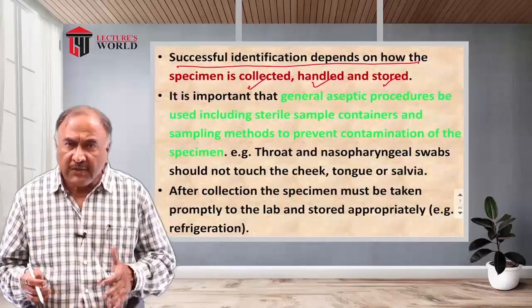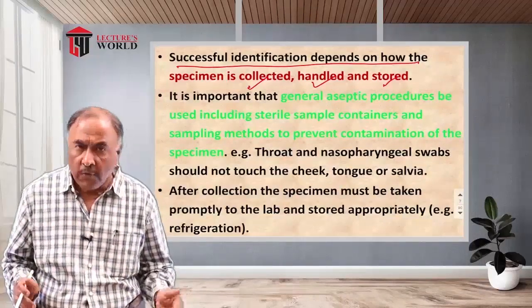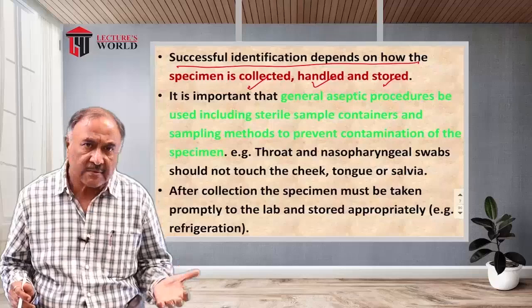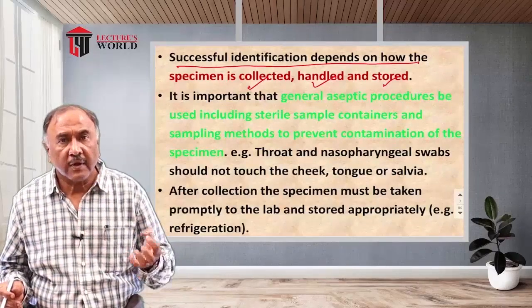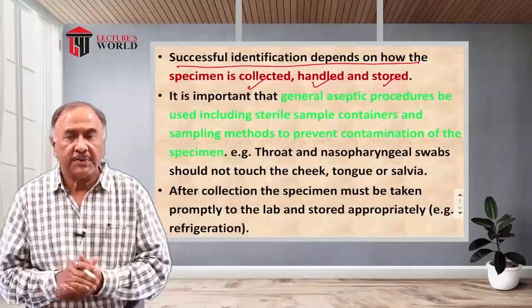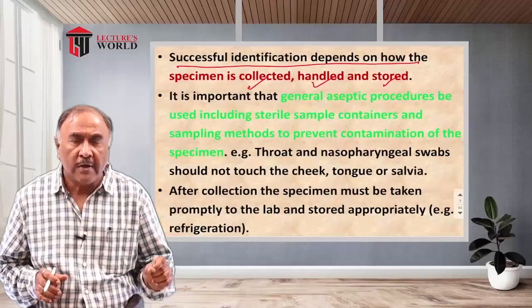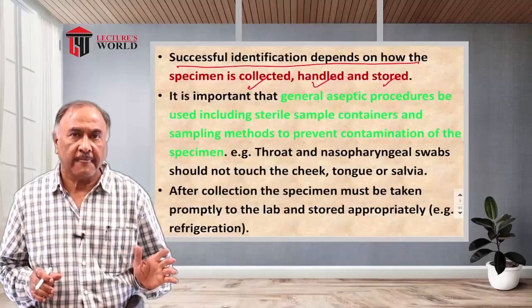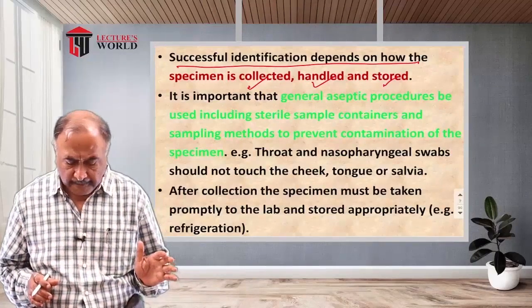We do this entire exercise, aseptic procedures, use of sterile containers, as well as sterile sampling techniques, with the primary objective of preventing contamination of the specimen.